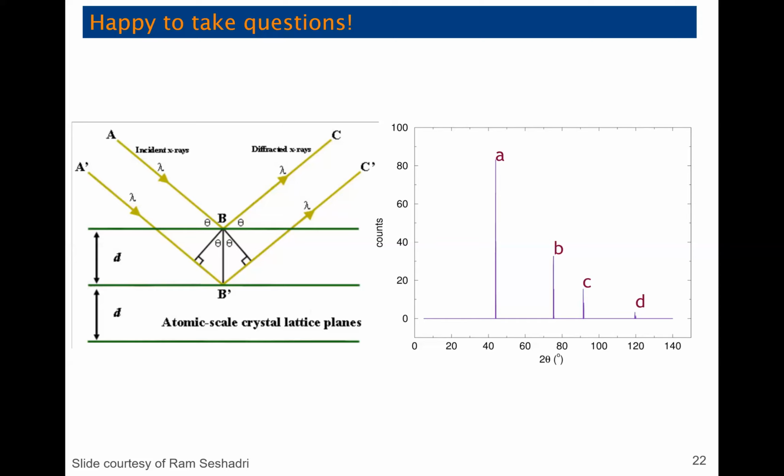We're close. One problem is your battery has to be air free on the inside. So we need to somehow seal up the battery, but still have a way of shooting the X-rays in and looking at the structure of, say, your cathode. One way that we do that is with a beryllium window. Beryllium is a material that has only a few peaks in the crystal structure, and they happen at fairly high angles.